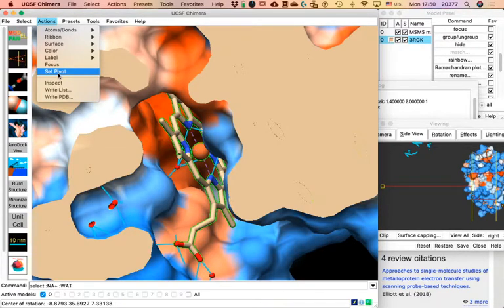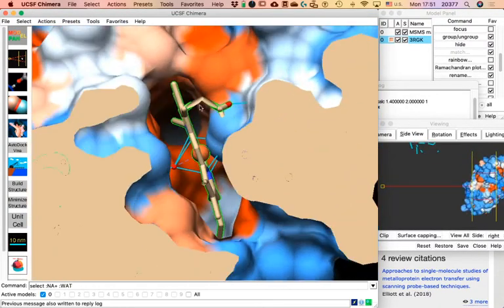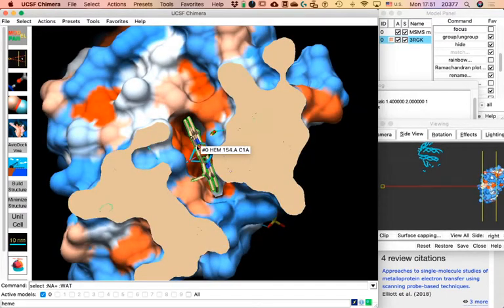This might seem easy or silly for this small structure, but when we start visualizing hemoglobin this will be crucial — otherwise you get lost. The purpose is that most of the time, interactions between proteins and other molecules do not happen on the surface — they happen inside the protein or towards the inside. This is a way to see and visualize those interactions.